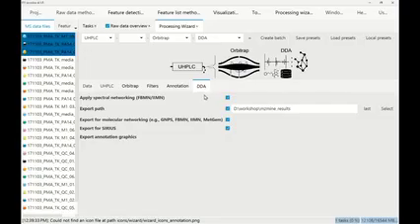And then the last step before we finally get some processing done and can look at it is the data-dependent acquisition, is the workflow. So there's a bunch of different workflows here, and if you have some ideas for new workflows, we are very eager to find some ideas to put more workflows and more presets into this wizard to make it easy for everyone to reproduce.